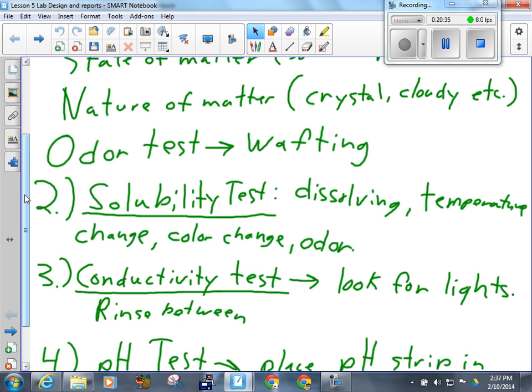All right, now, these conductivity testers are far better than the ones we initially got because they actually tell you if they're working. When you press the button, the little on light goes on. If when you press the button, the on light does not go on, you need a new battery. So make sure you check that.